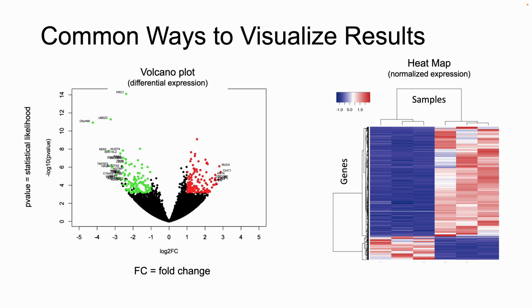So if you're to the left of that, and now your p-value, that's probably 0.05. I don't remember off the top of my head the translation. So those are both significant and have a fold change greater than 2. That's what the volcano plots are meant to show you.